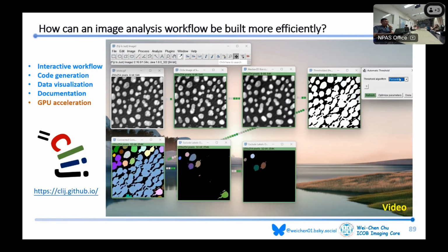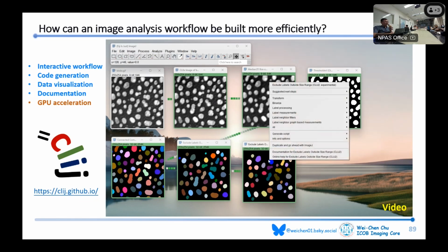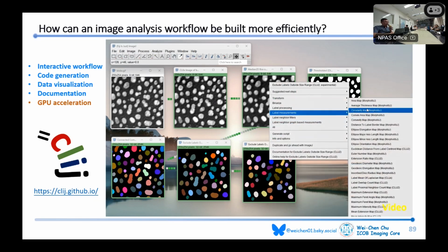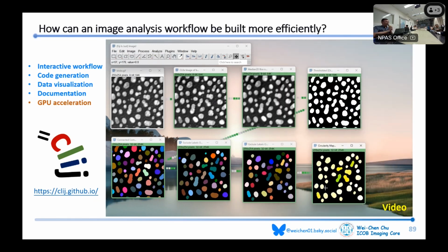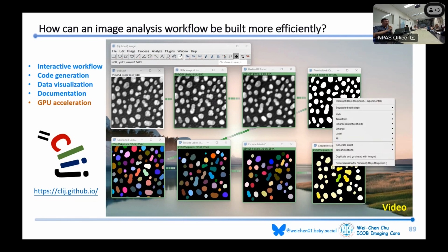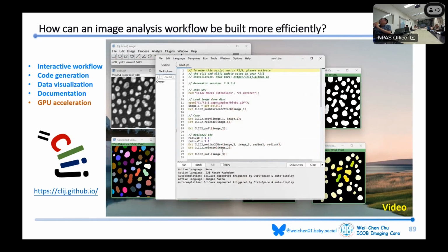You can change different places, change parameters, change algorithms, and see how the result looks. Finally, you can generate a script with a simple click, or a visualization. This is also a kind of data visualization, for the guys' circularity maybe.